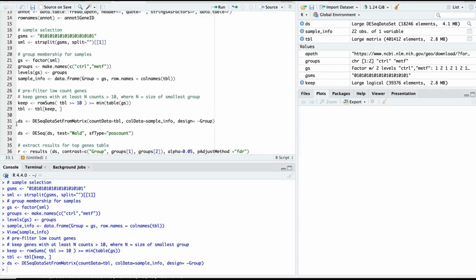That's the core of the DESeq2 protocol, that first you declare the variable where everything is already reported, and step 2, you run the so-called function DESeq, which performs the analysis all in one line.